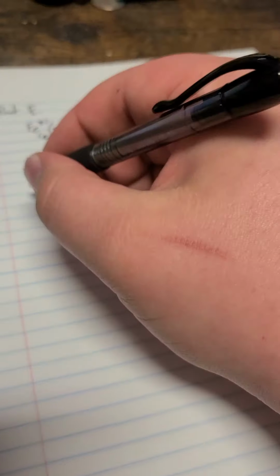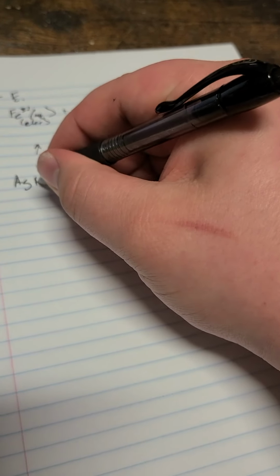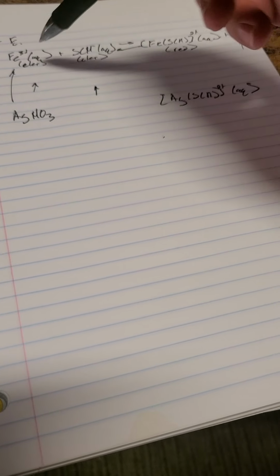When AgNO3 is introduced into the equation, it takes the place of the iron originally up here. This would cause the result to be AgSCN and would cause the iron to remain aqueous, thus the cloudy white resulting solution.